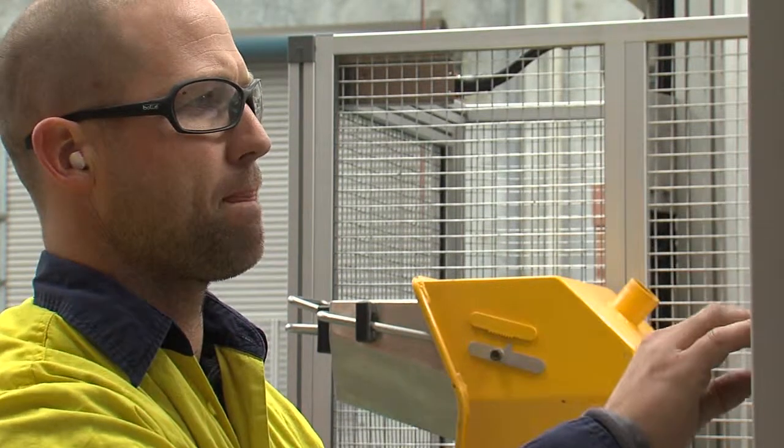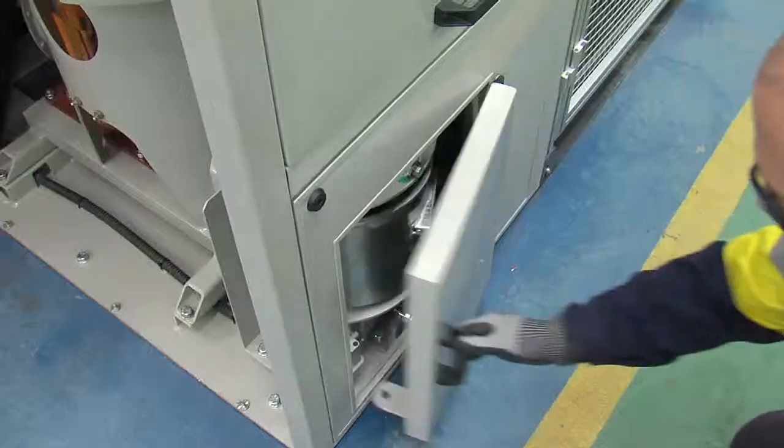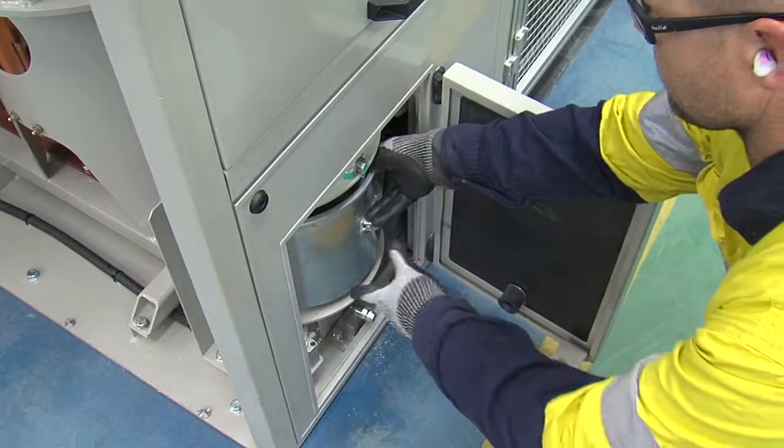Importantly, there is no need for skilled operators. A dried field sample is simply loaded into the crusher and the assay portion is collected at the other end.